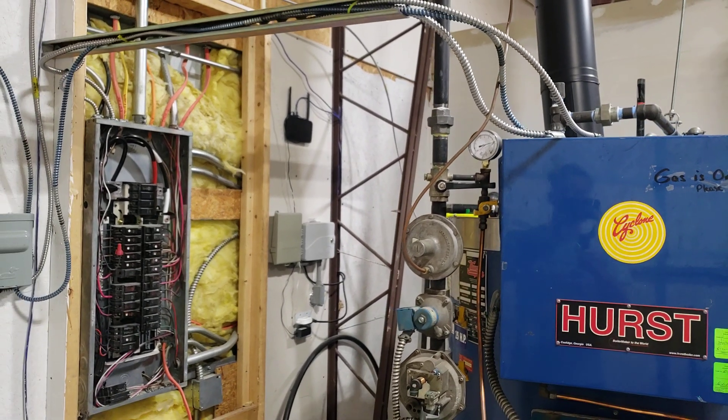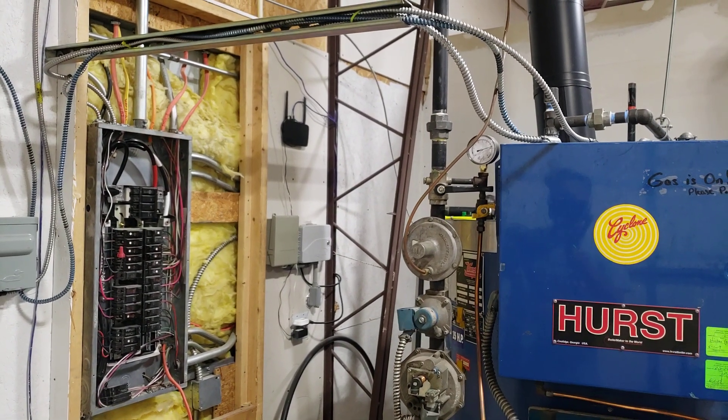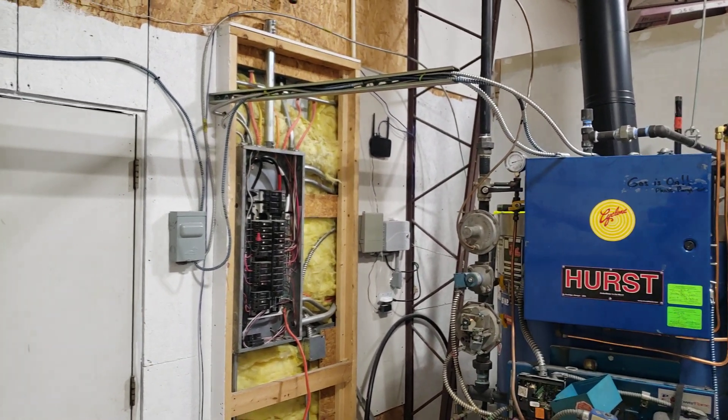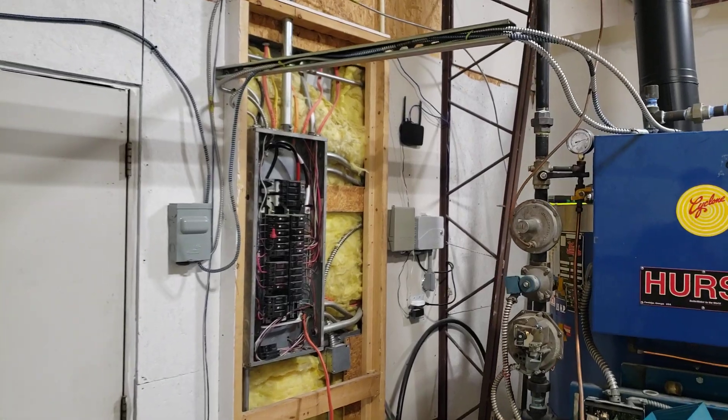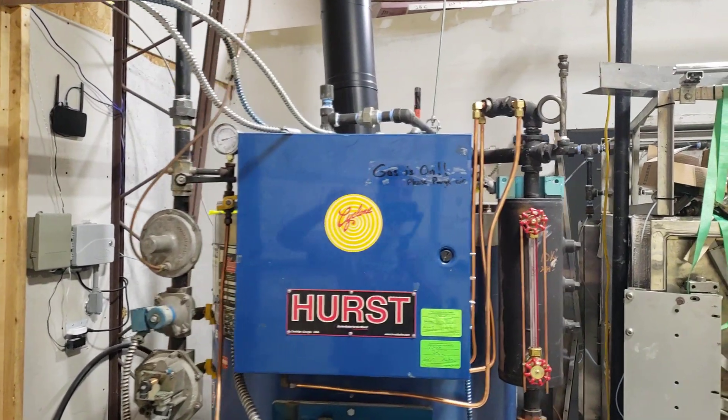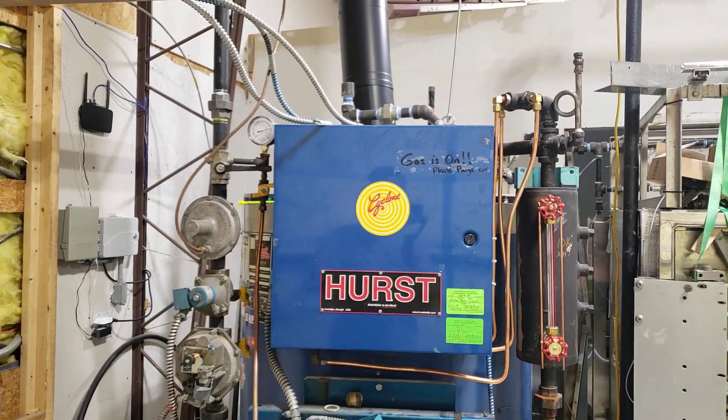The next thing you're going to need to do is run your electrical. In my case I had them do it because it was a confusing mess with all the e-stops. The pump line goes to the e-stops — they hooked all that up.